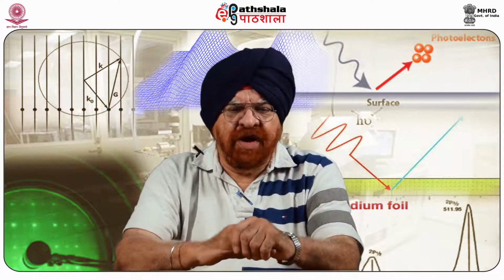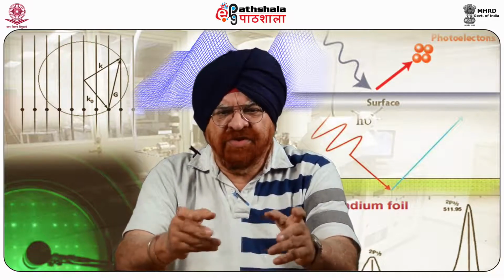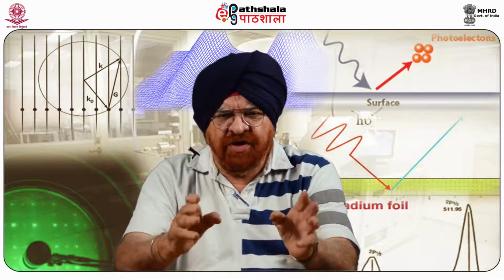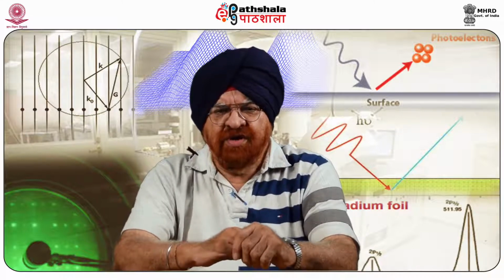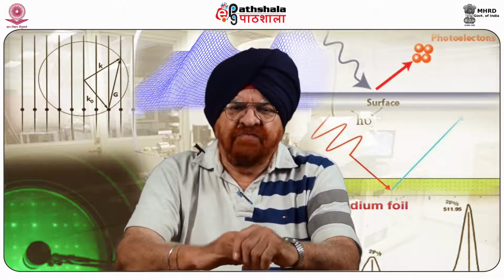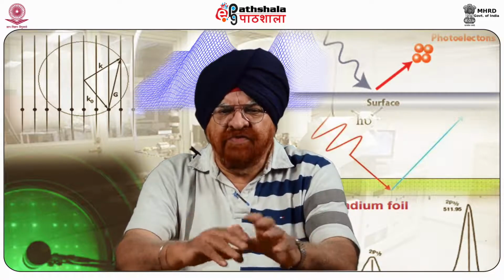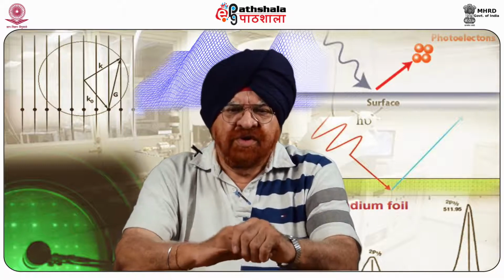Introduction and background of this microscopy. Obviously, this is needed to know because in this part of the century, from 1920 to about 1980, many surface analytical techniques came into being, and Kelvin probe force microscopy is one of those.